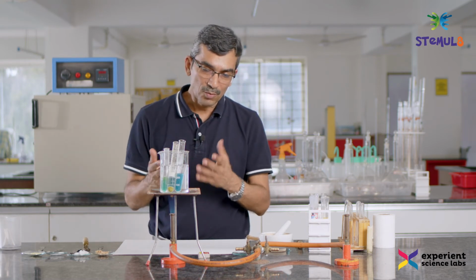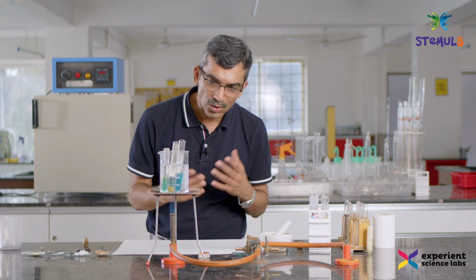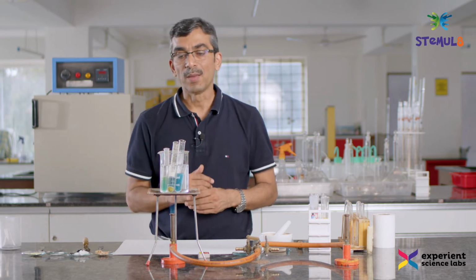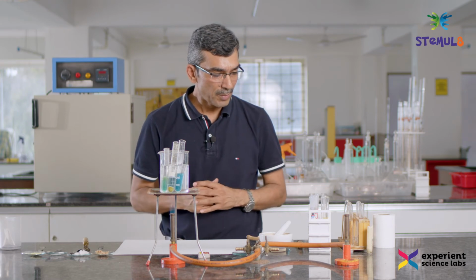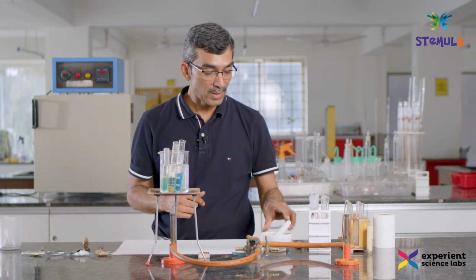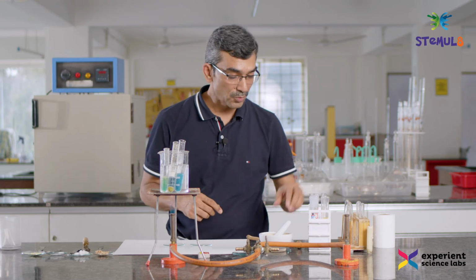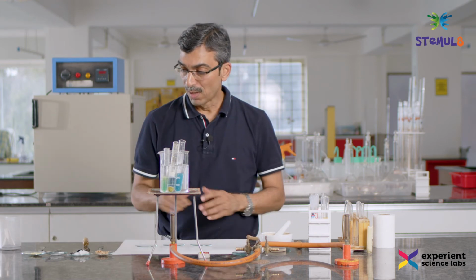We will observe this process for maybe 3-4 minutes because the water is still not really hot, it's not boiling. So we should start looking at the change of color 2 to 3 minutes from the time the water starts boiling. Let it go on for a while, and in the meantime I will test for the presence of vitamin C in the fruit juices, and also take rice this time, if we have not used it for a while, and see whether there is any color change.